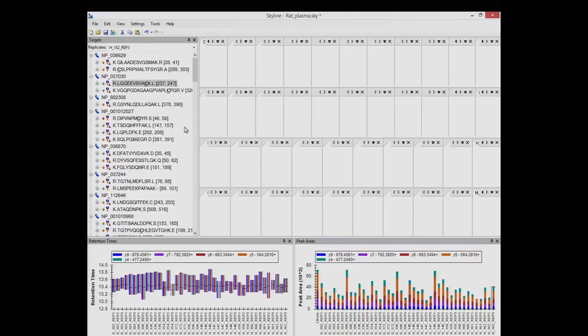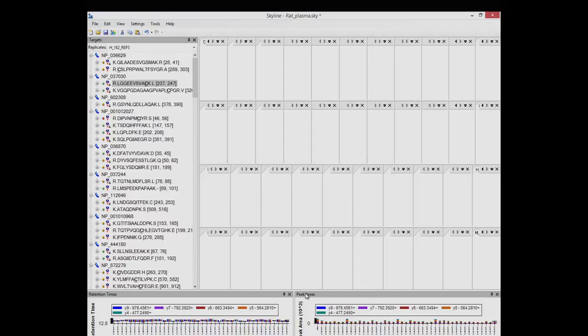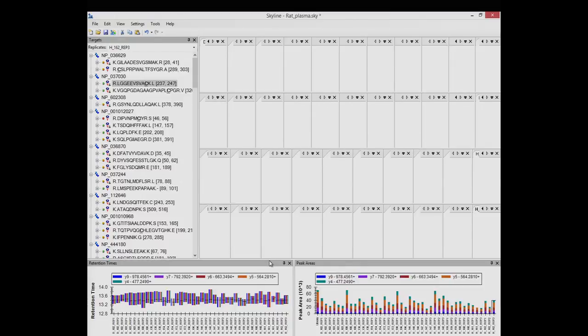If we had a lot more screen real estate, that might be interesting. In this case, it just gives us a whole lot of blank boxes because there's just not enough room to graph in here. And if you ever get into a state, it can be a lot less severe than that one. Like if we put the graphing package that Skyline uses in a state where it can't draw the graph, basically there's no graph region anymore. It just blanks everything out, and that can be kind of startling to people. And I've gotten support requests about, why am I getting this blank box? It just means that you've got to give it more space in order to see it.